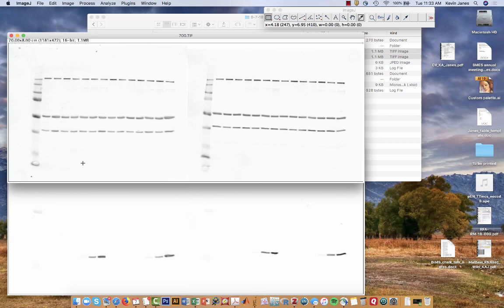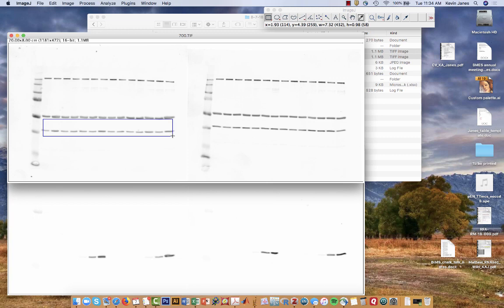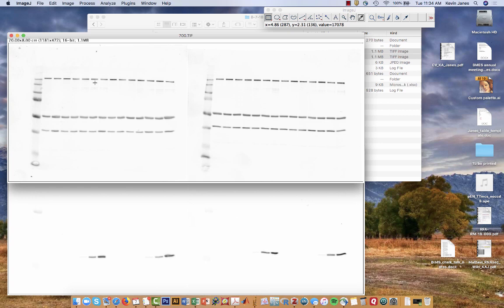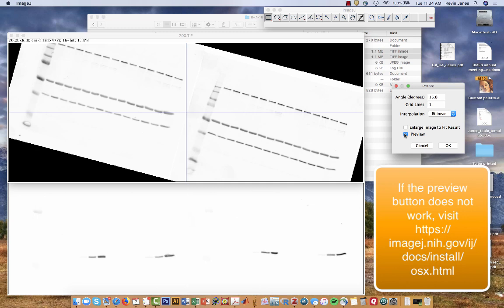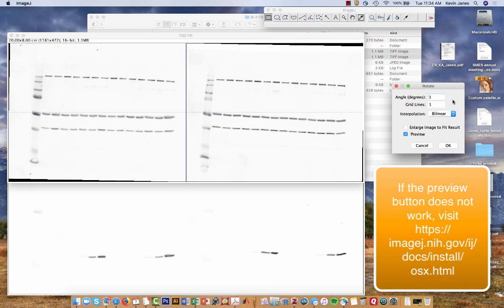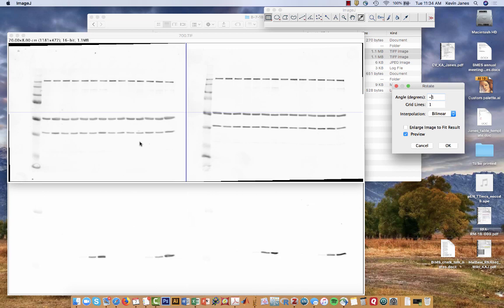To begin, we need to make sure that before we do any densitometry that the lanes are perfectly horizontal. If the lanes are off on a diagonal it's going to make it harder for us to quantify. The way that we rotate the image is image, transform, rotate. It's generally helpful to keep the preview button on. I'll do a negative one degree rotation which does a pretty good job for the left hand image.